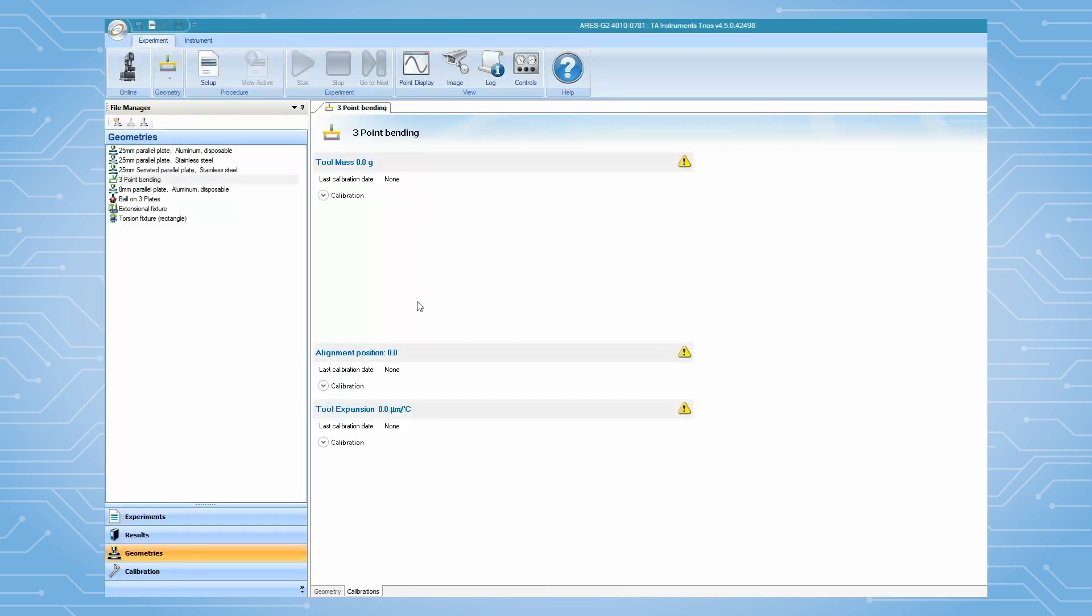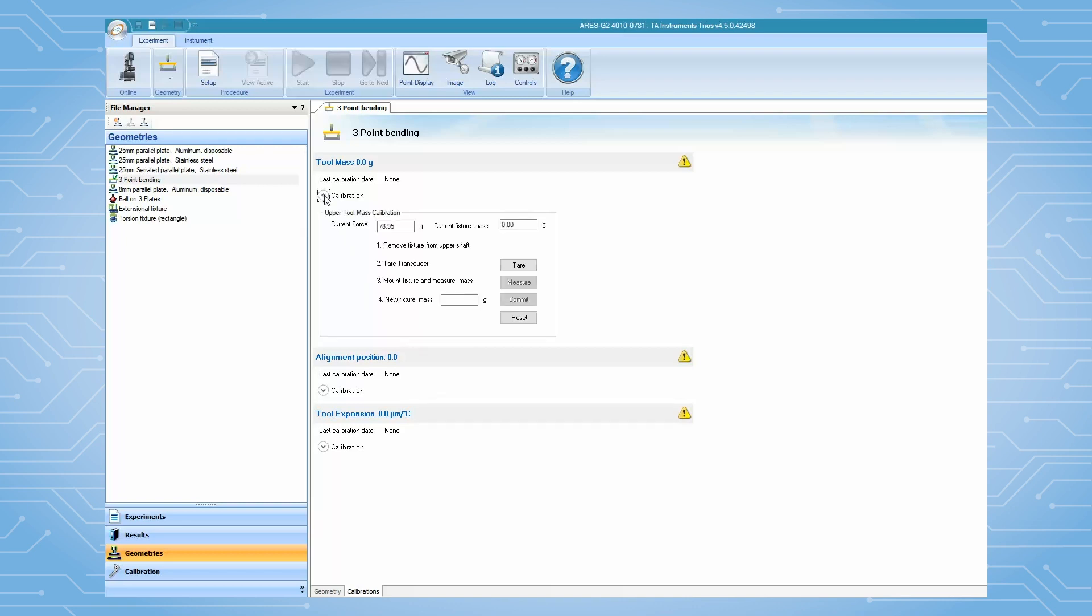Then, TRIO will automatically lead you to proceed for the clamp calibration.